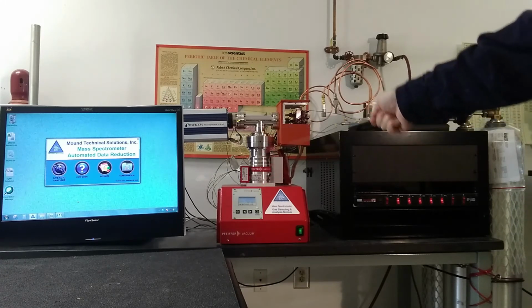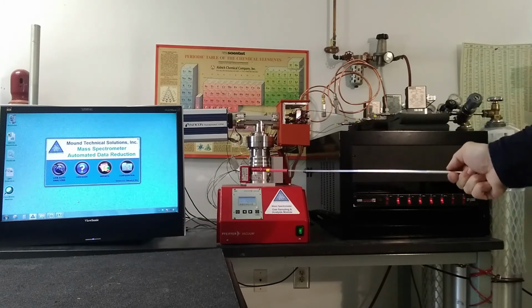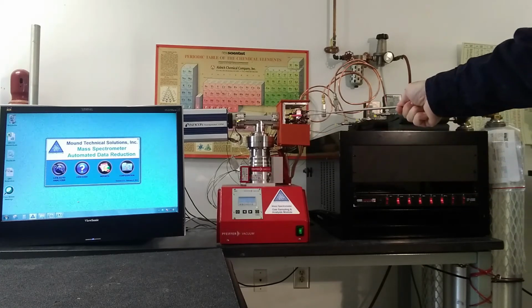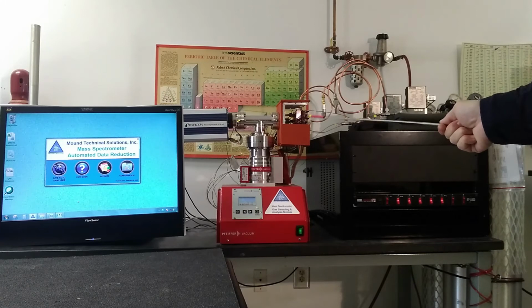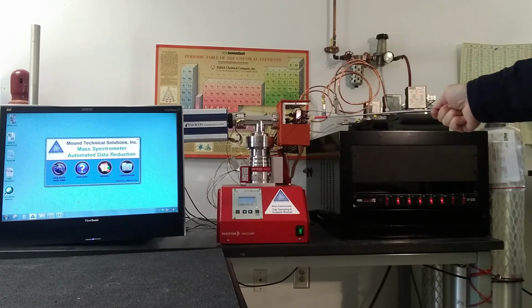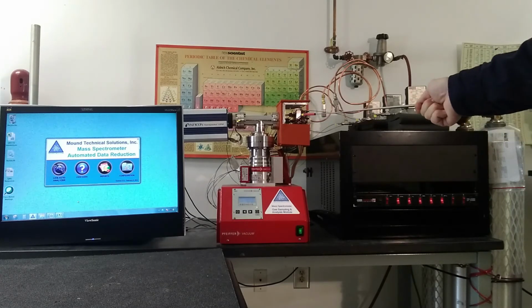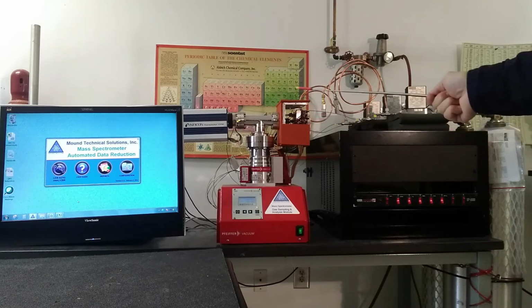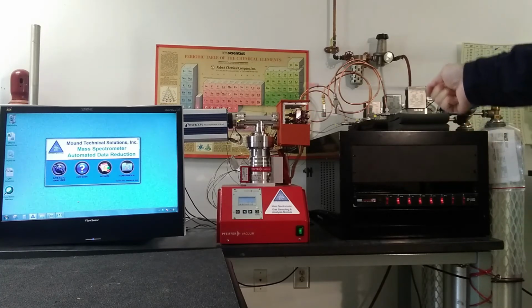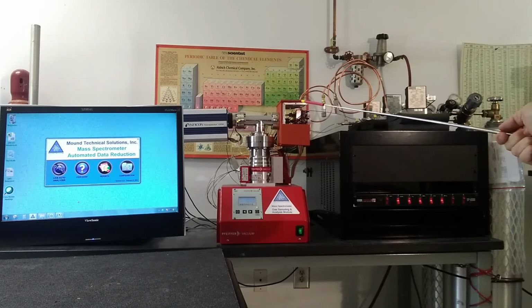Our two-stage vacuum station is a turbomolecular pump backed up by a diaphragm roughing pump. The inlet system, in this case, is one of our multiplexed inputs. This particular one is an 8 capillary input switched by electronic valves, so we can automatically or manually select which of the 8 capillaries we want to introduce to the sample chamber.